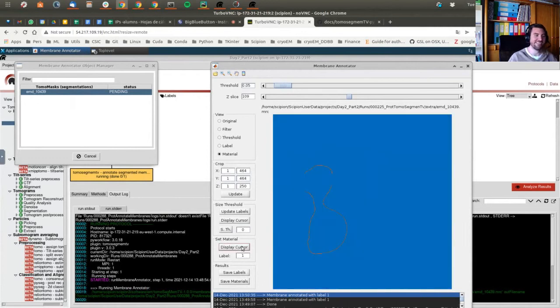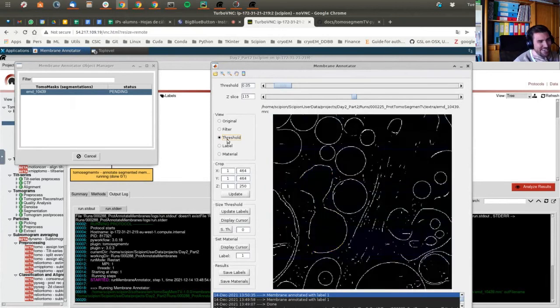This is not the whole membrane, but it is the best we can have in this case. But a lot of information can be obtained from there. This is not an easy case. How do I get there now? I think I also used the wrong cursor, because I'm not able to do the labeling and get this nice background.